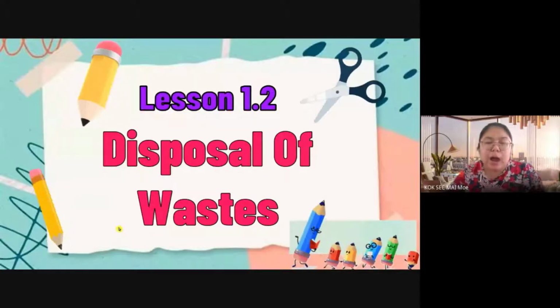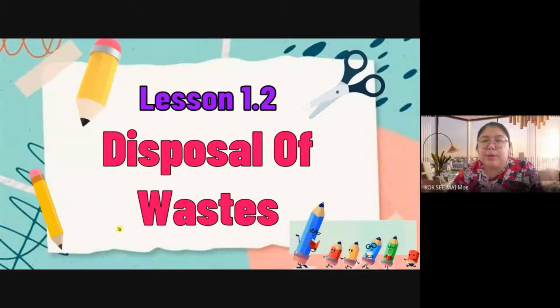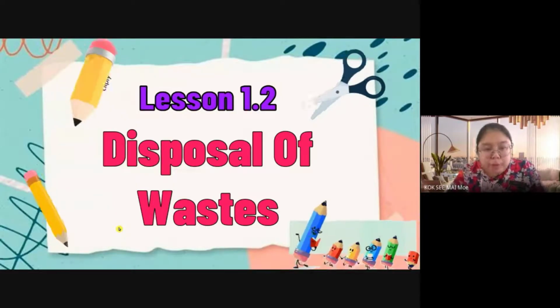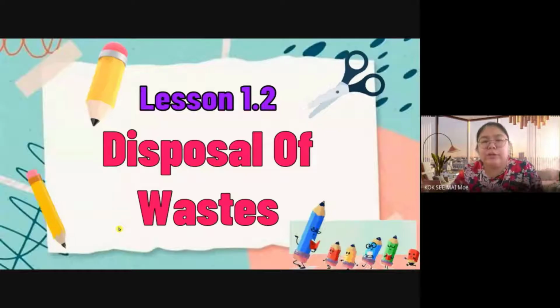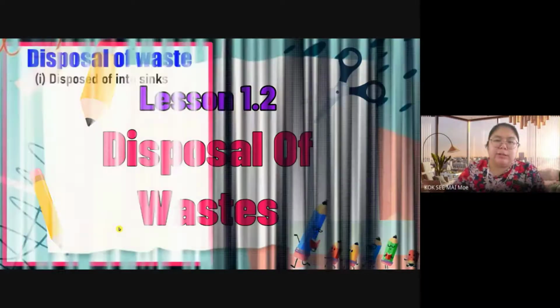So you need to know how you need to manage the waste. Maybe you do the experiment, they got extra, is it? Okay, the acid, after you do the experiment, where do you want to put it? Then after that, you burn. After burning, then the magnesium, where do you want to throw it? All these things we need to know how to dispose. Okay, then we're going to see.